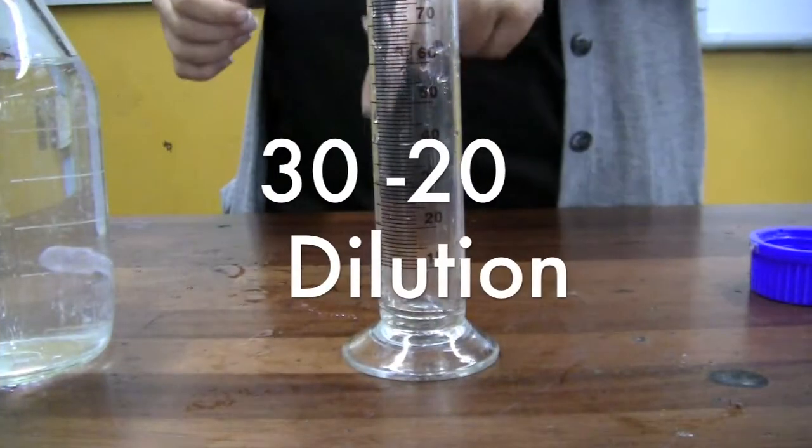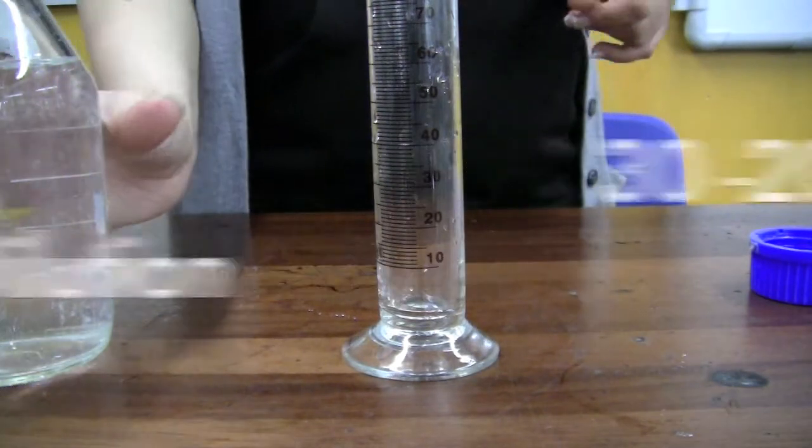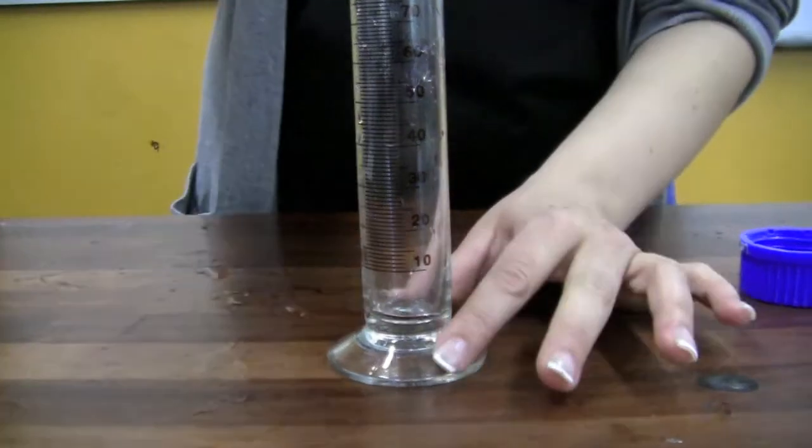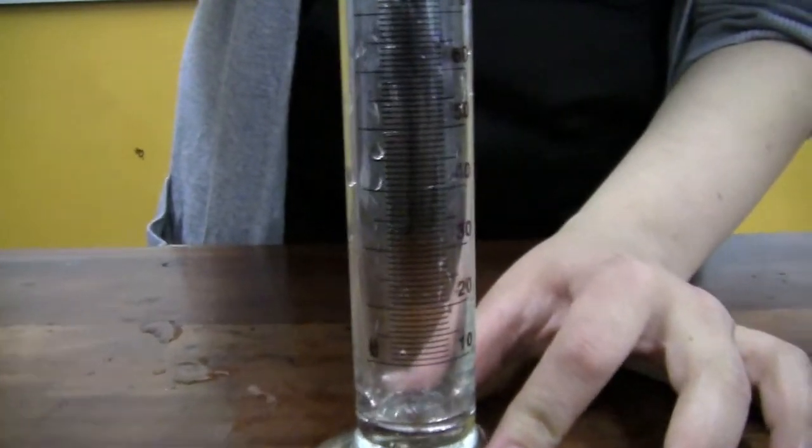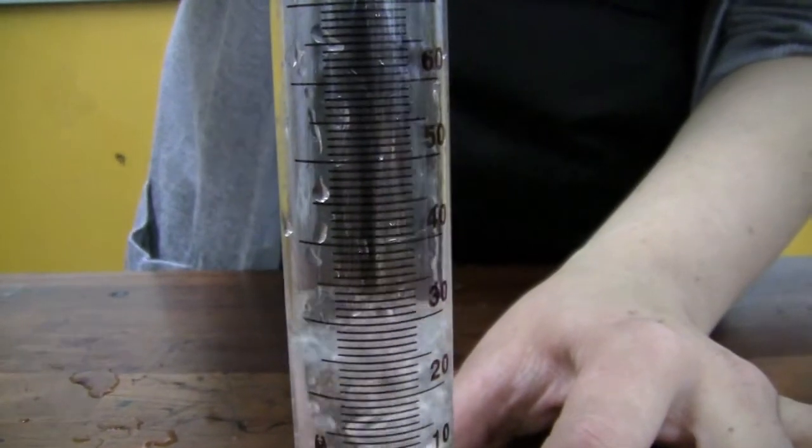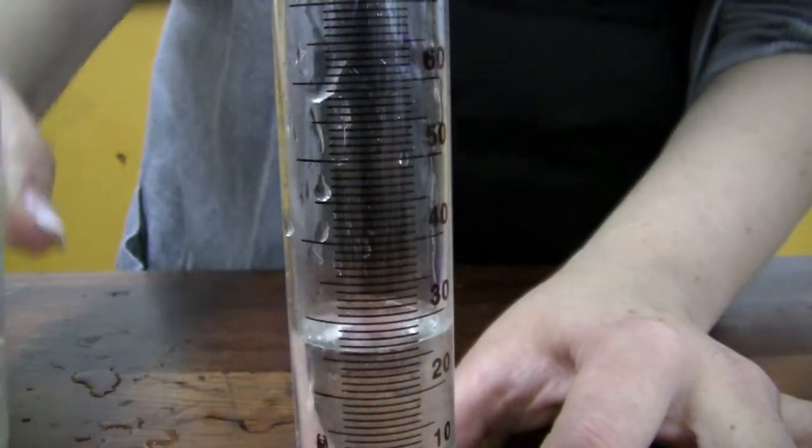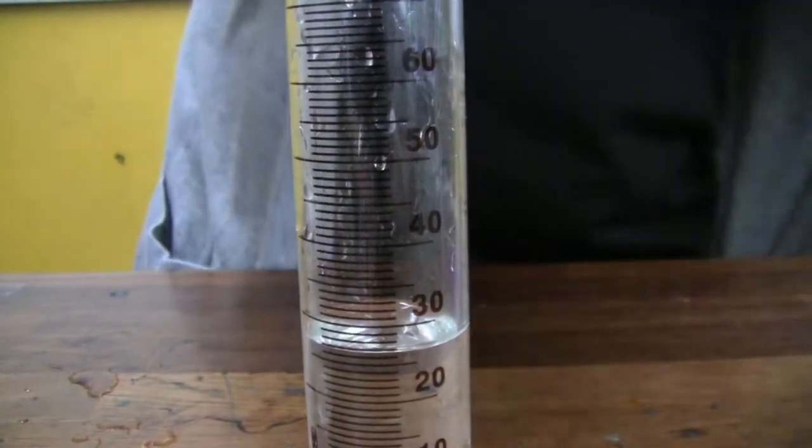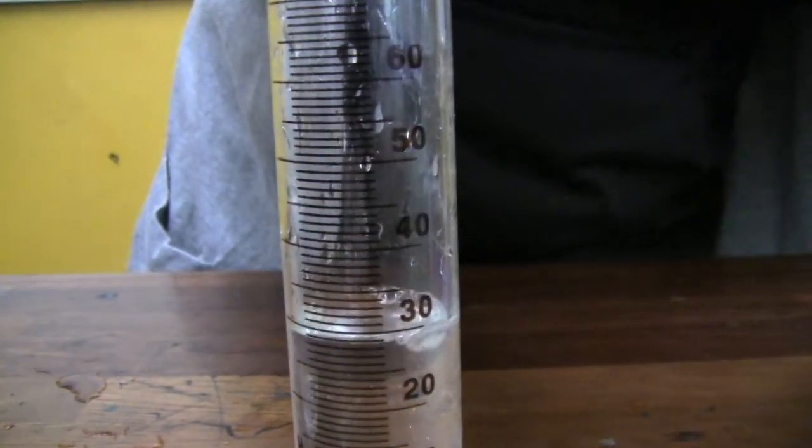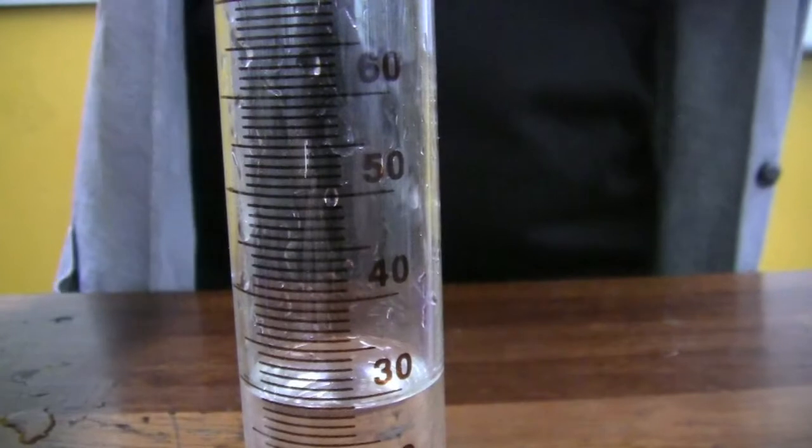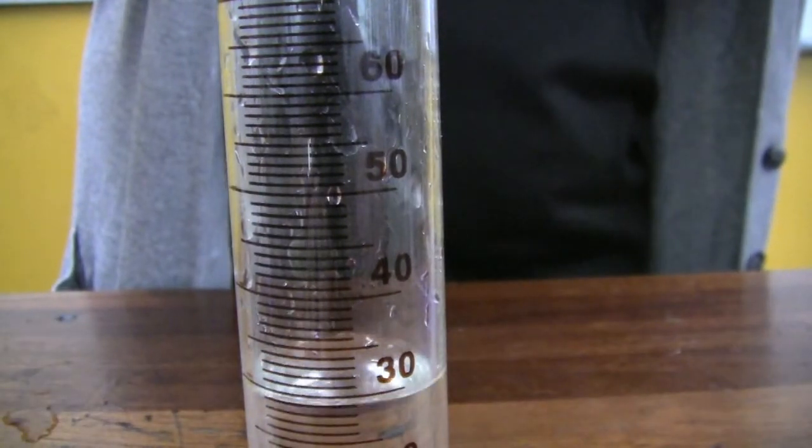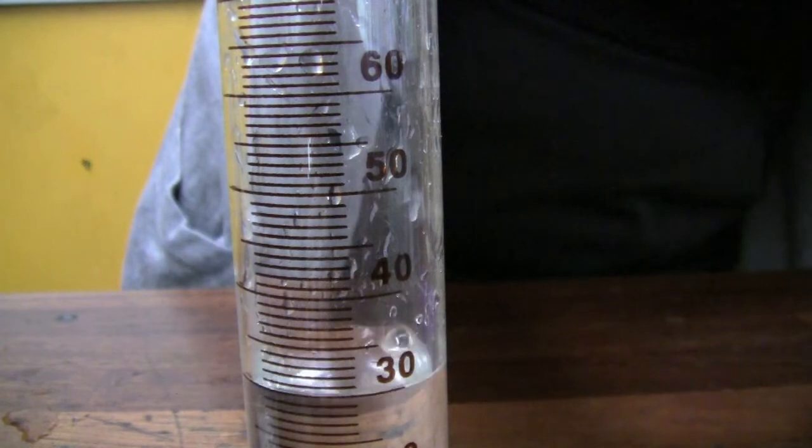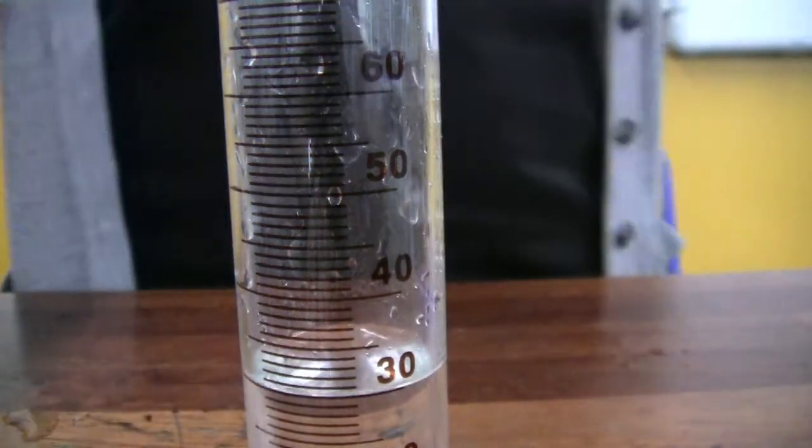For the third concentration, we need 30 ml of sodium thiosulfate. So we can pour in again up until about 25. And we're going to stop, finish off with the pipette, up to 30. Making sure that the meniscus is in line with the 30 line.